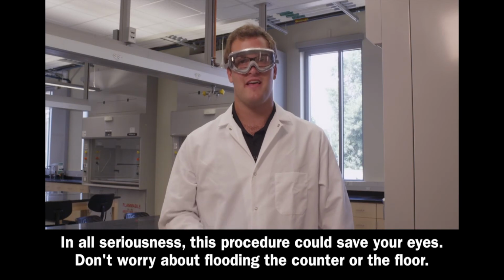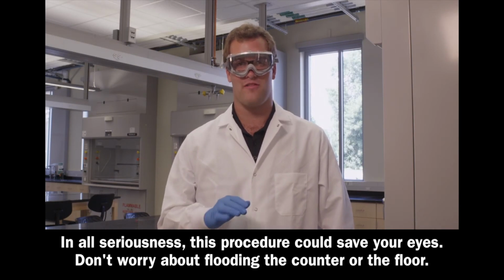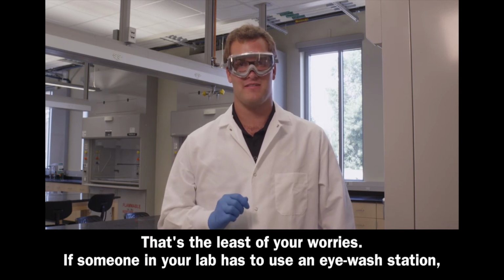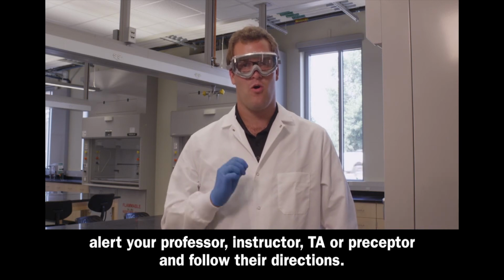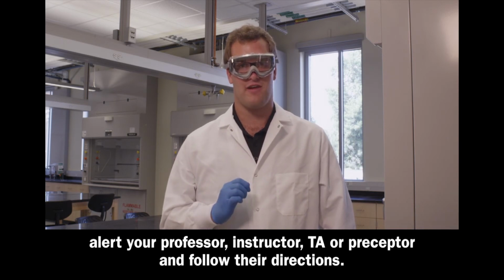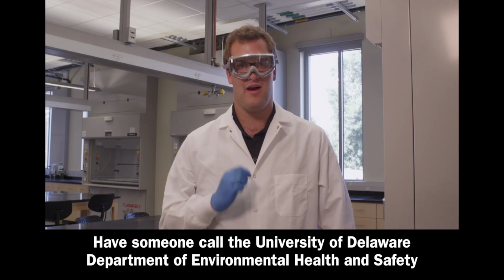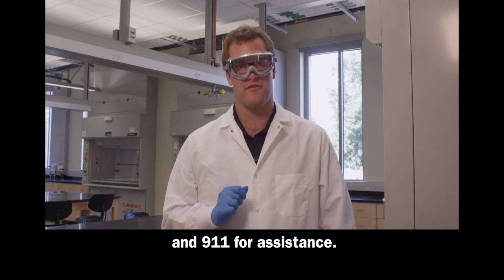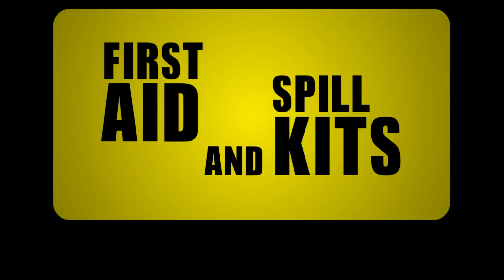In all seriousness, this procedure could save your eyes. Don't worry about flooding the counter or the floor. That's the least of your worries. If someone in your lab has to use the eye wash station, alert your professor, instructor, TA, or preceptor and follow their directions. Have someone call the University of Delaware Department of Environmental Health and Safety and 911 for assistance.